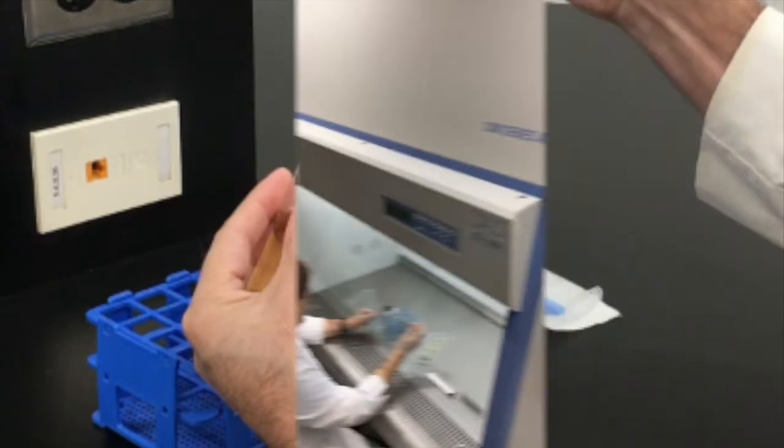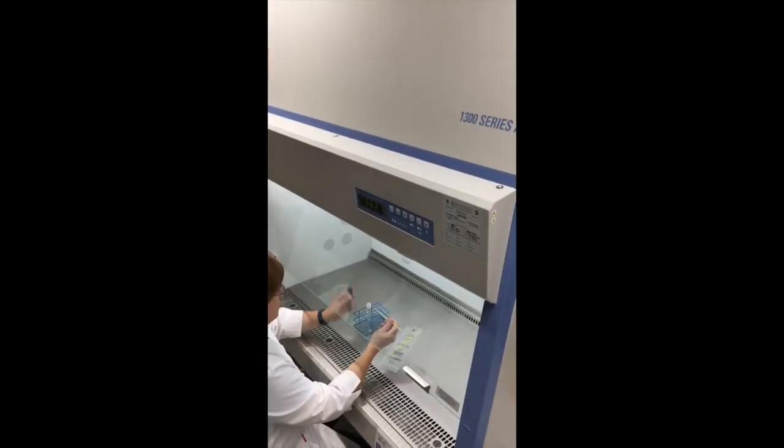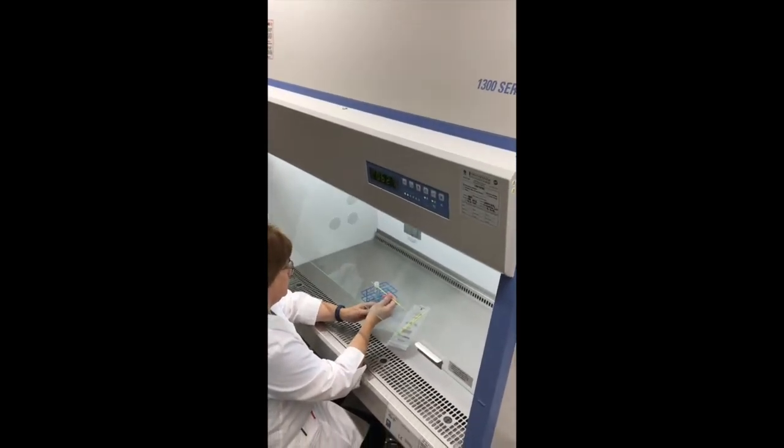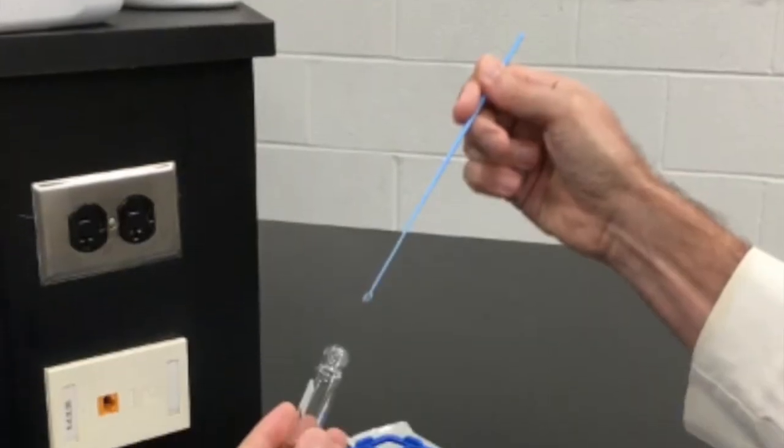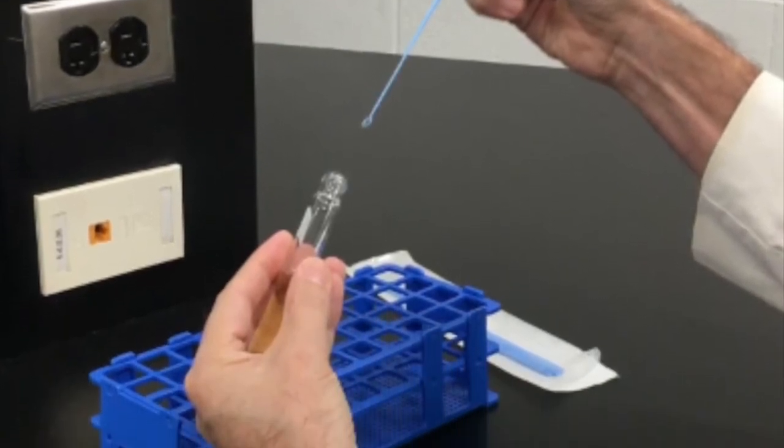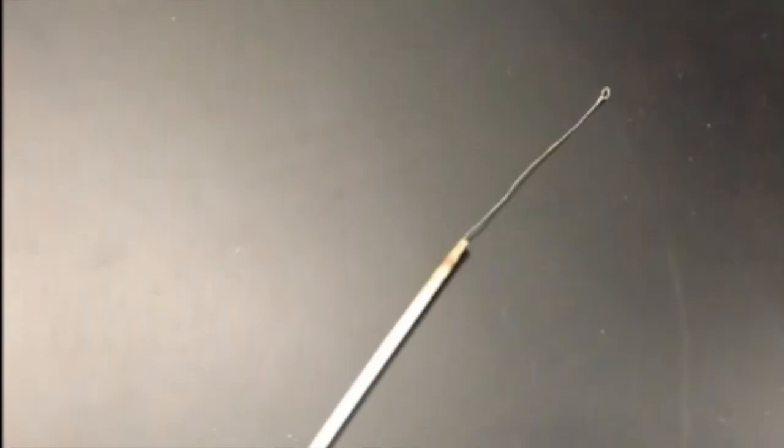When working with disease-causing microbes, a biosafety cabinet will both protect the researcher from exposure as well as prevent contamination. Even without fancy equipment, it is possible by using aseptic technique to prevent contamination of materials.